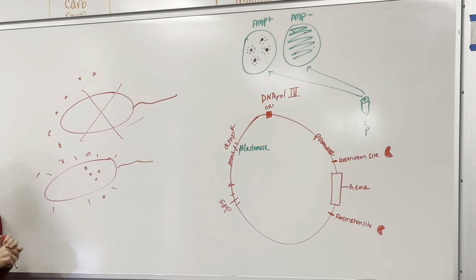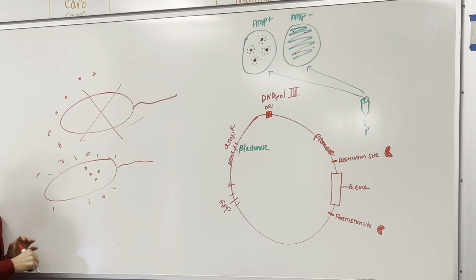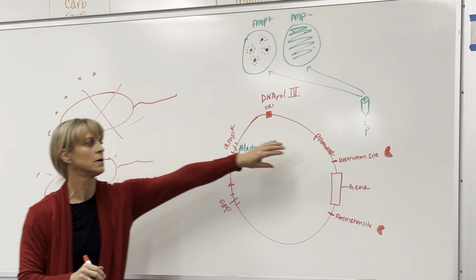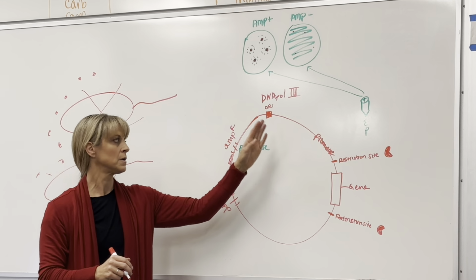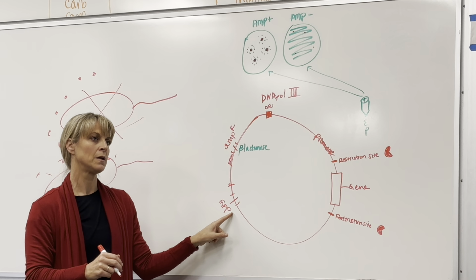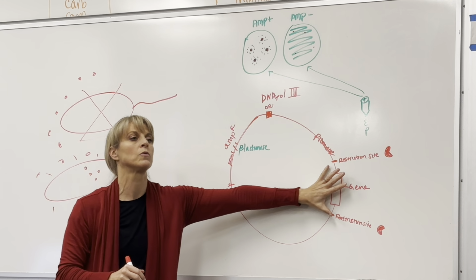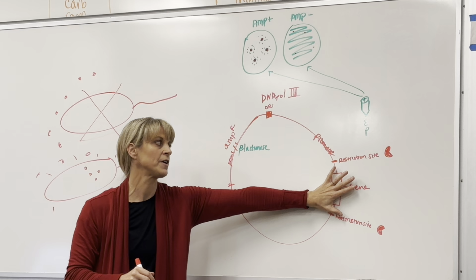Dr. Duffy, are you asking? Like the specific one you're inserting between the restriction sites, not the plasmid itself. The one that makes it glow. No, not how did we get these genes in here, but why are we putting that gene in there? Why are we putting in ampicillin? No, the gene we're inserting, the other one. Oh, this one. Yeah. I guess just a good diagram question. No, this is a very good question.